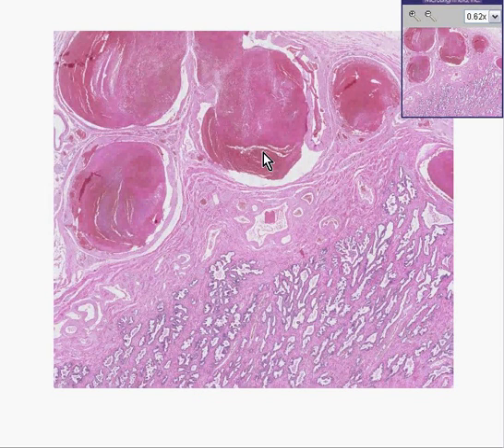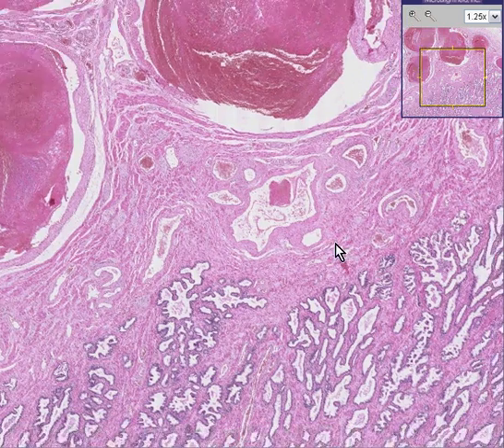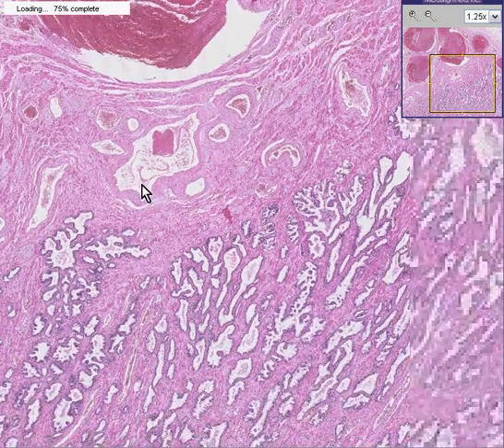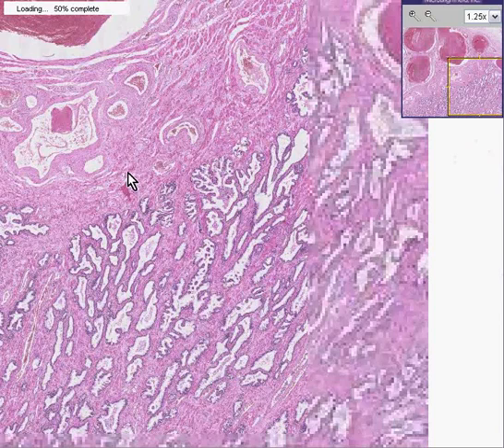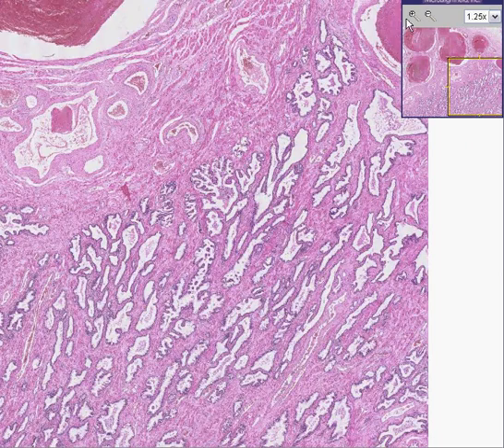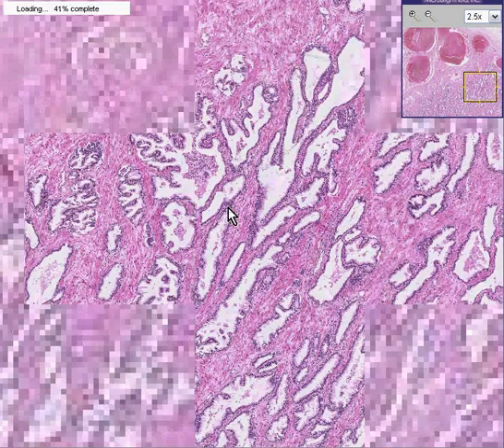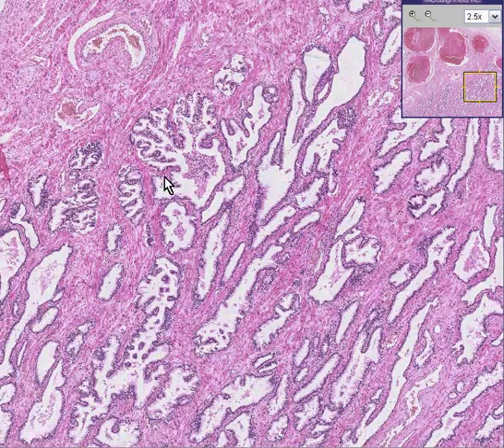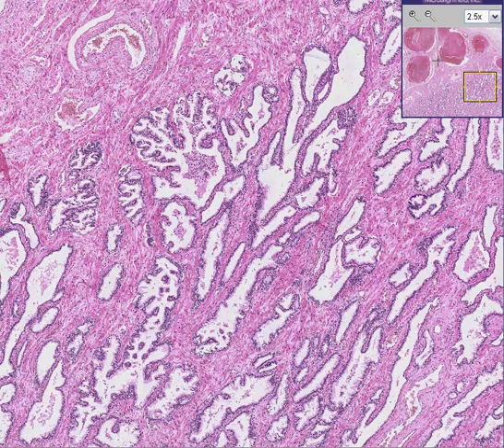What do we have here? Well, let's look a little closer and see if we can find out. We have what looks like a glandular structure. You see these glandular spaces, some of which appear a little bit papillary.